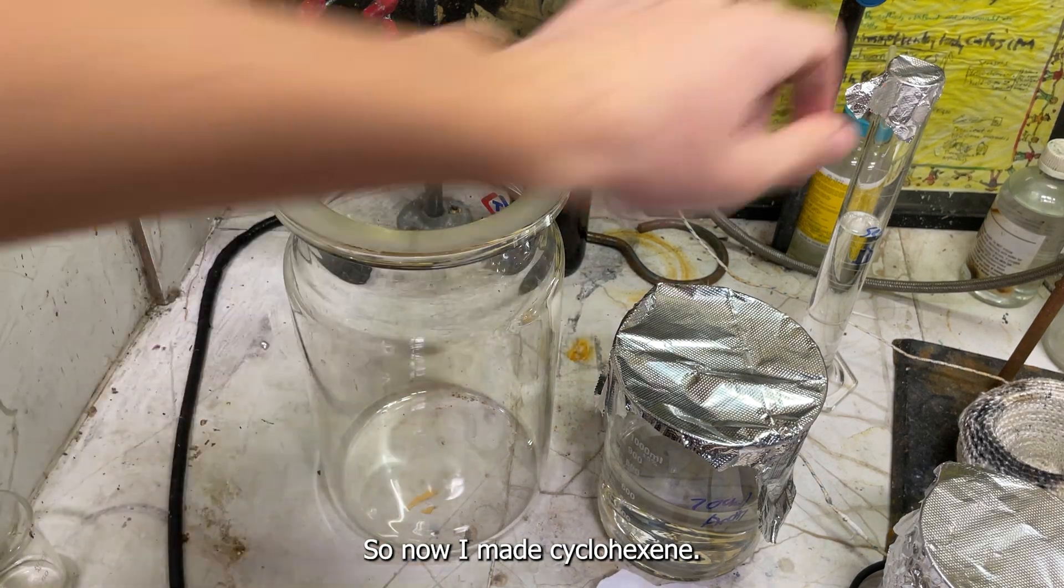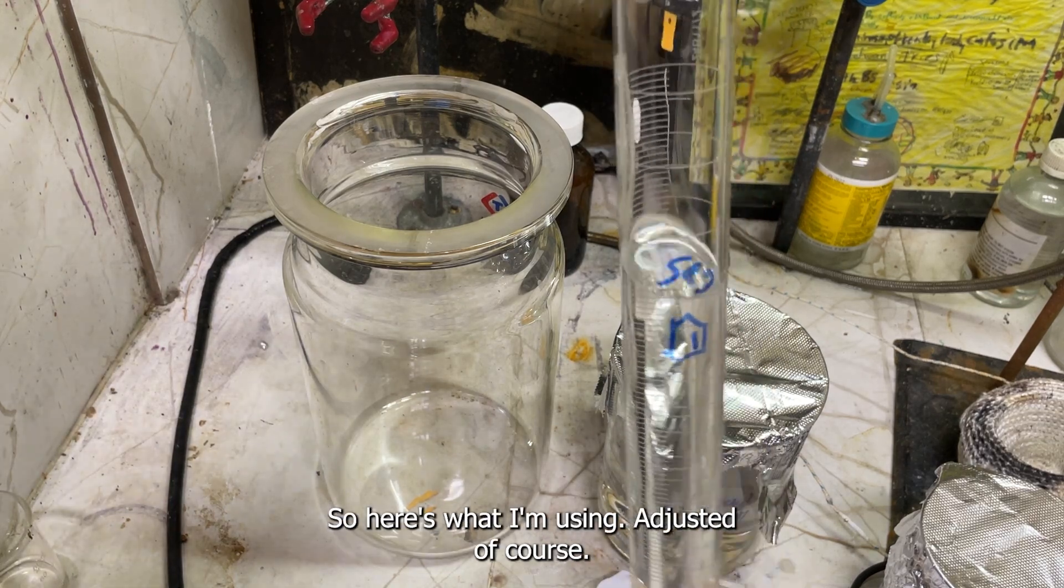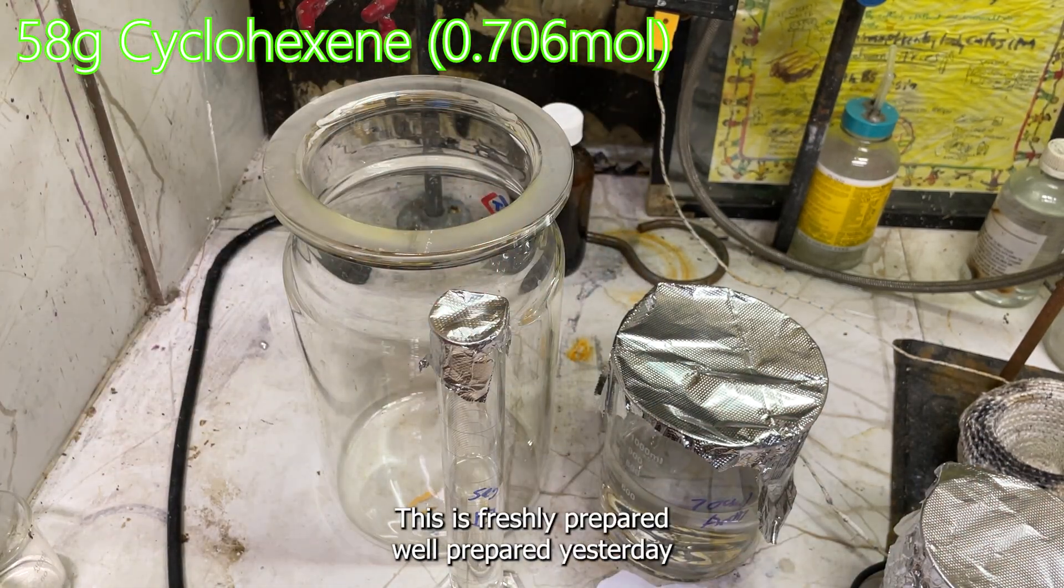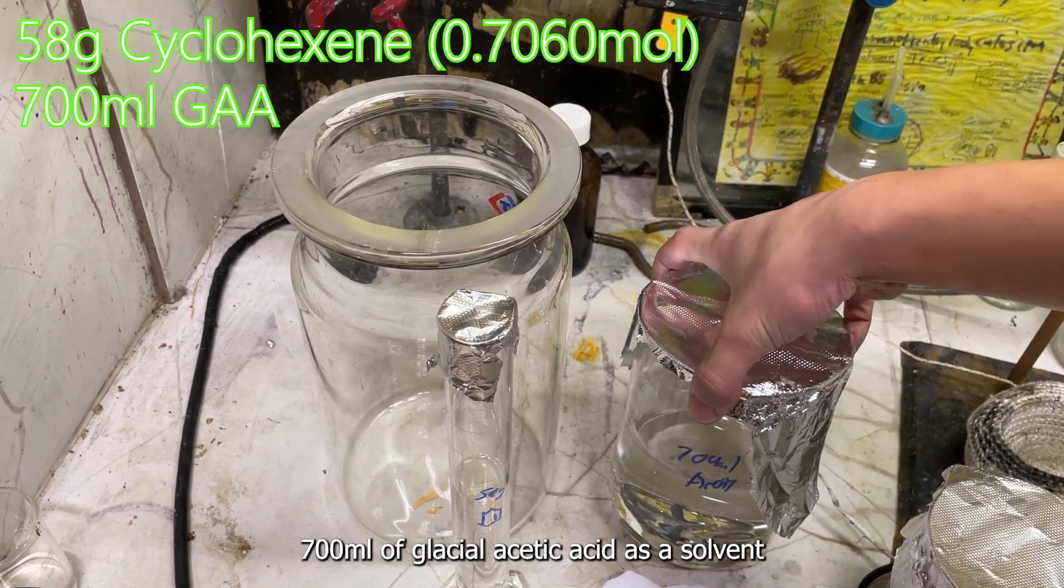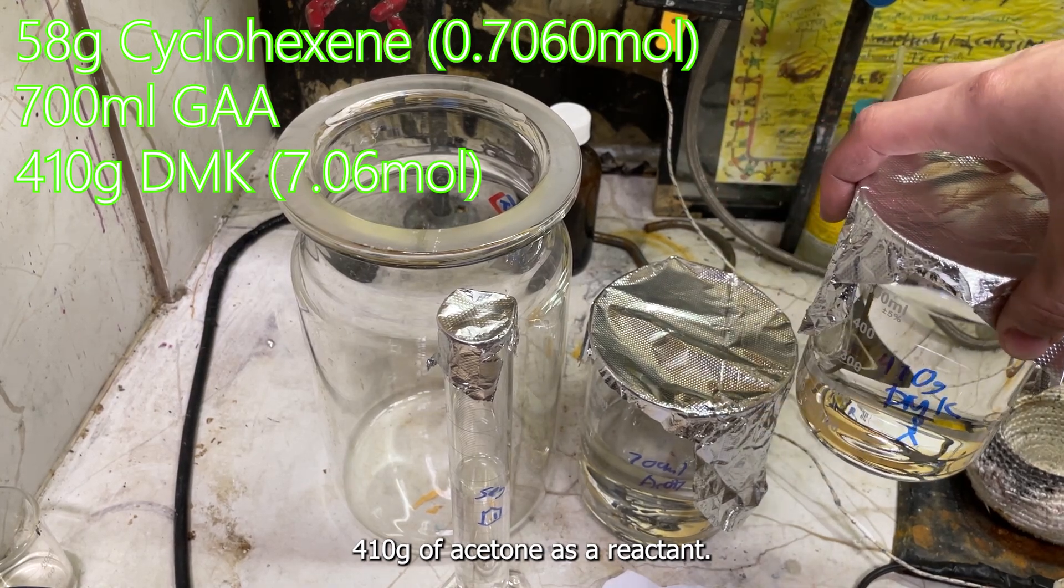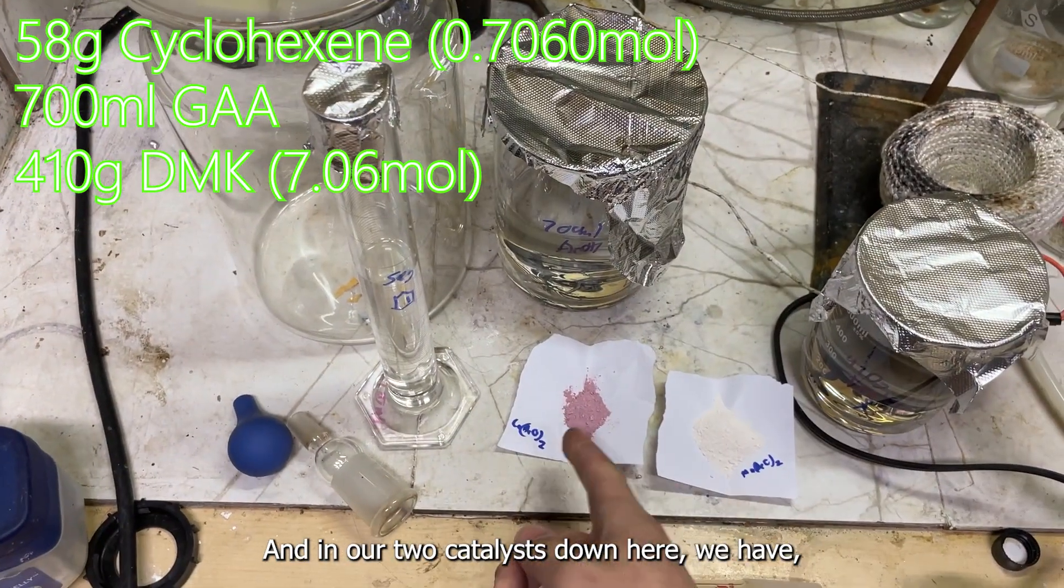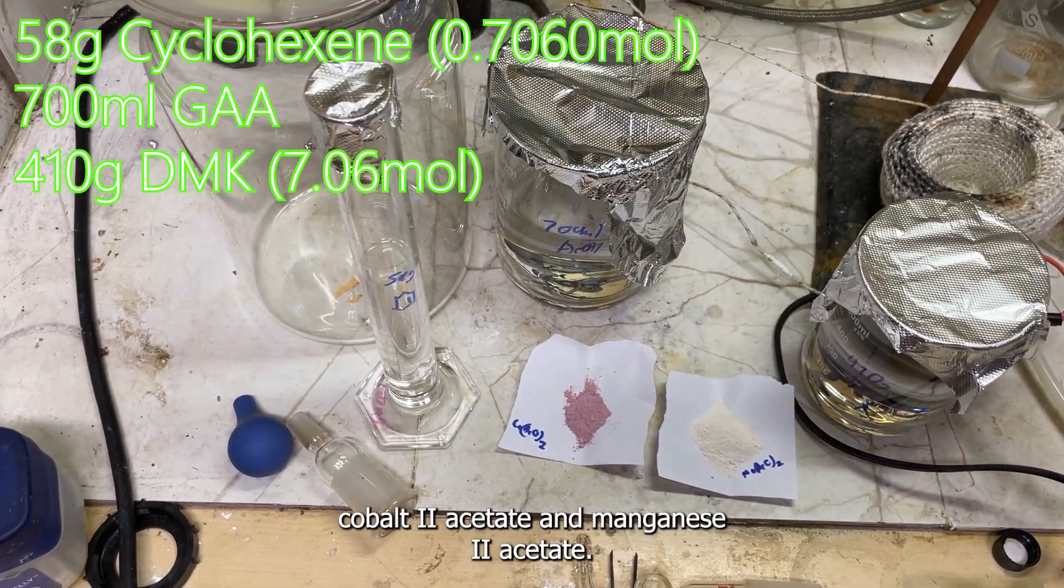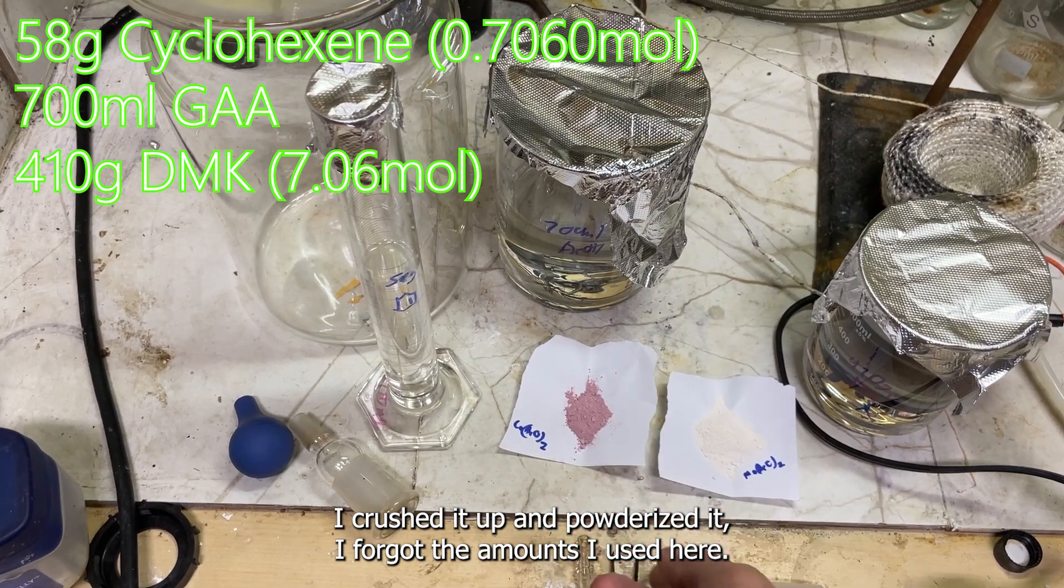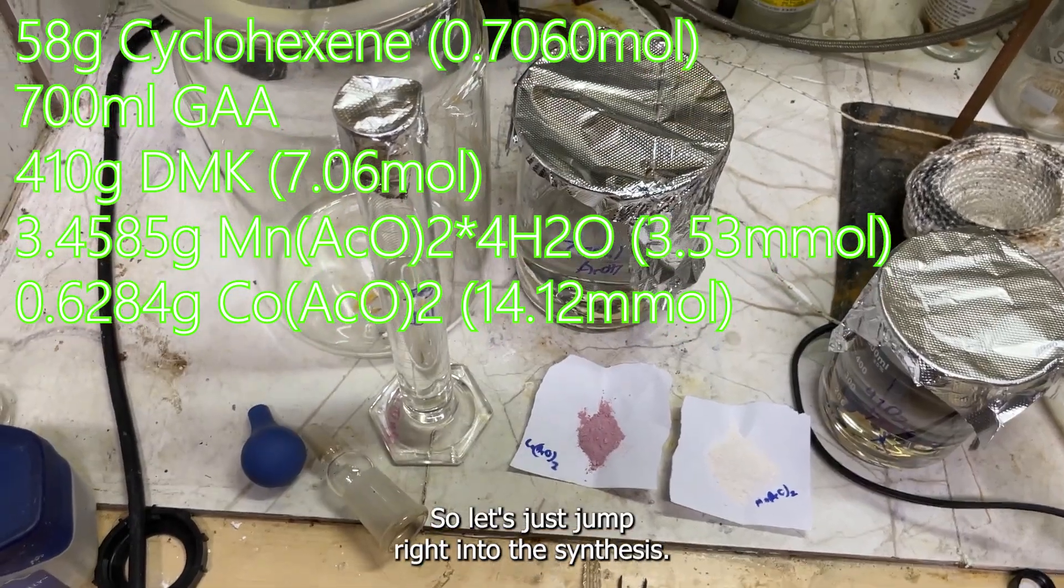Now I made cyclohexanone, this is cyclohexanone I made myself, so I didn't have the amount the patent used. Here's what I'm using, adjusted of course. We're using 58 grams of cyclohexanone, freshly prepared yesterday. 700 milliliters of glacial acetic acid as a solvent, 410 grams of acetone as a reactant. And in our two catalysts down here we have cobalt-2-acetate and manganese-2-acetate crushed up and powderized. I forgot the amounts I used here, so I'll throw them up on the screen right now.